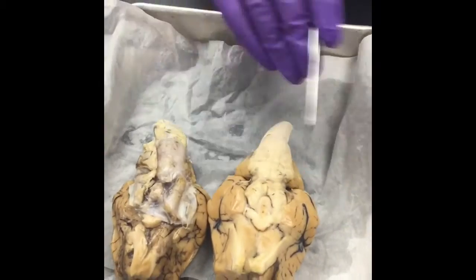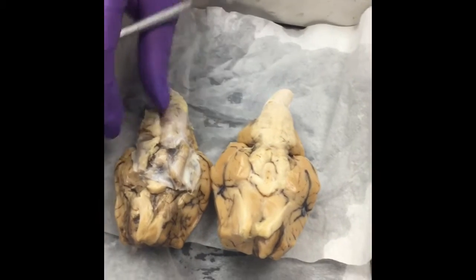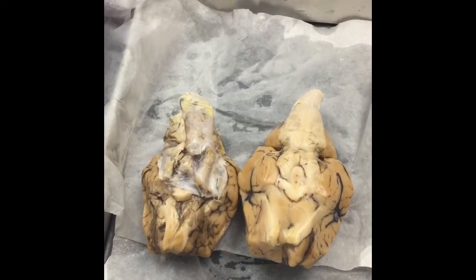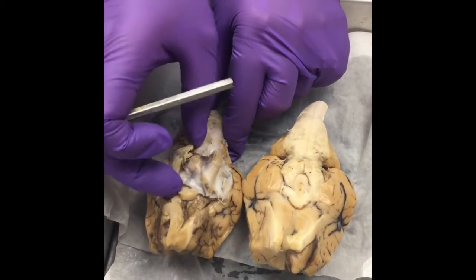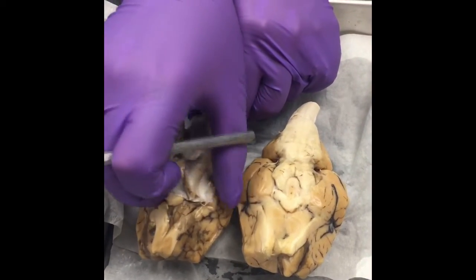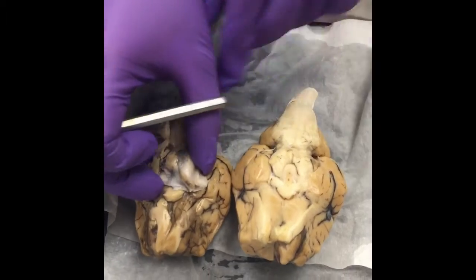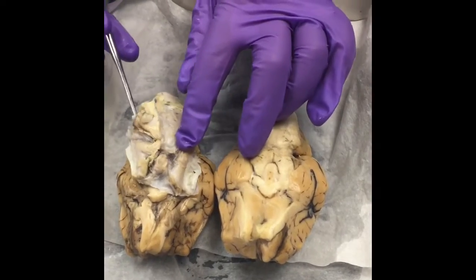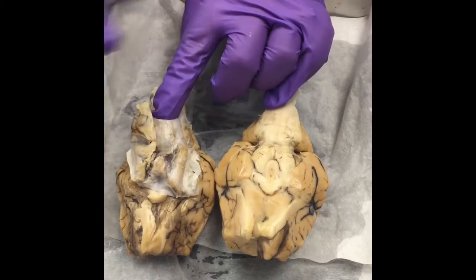You ready? Okay, so they look very different, right? They're both flipped over. So this is the underside of the brain, but this piece has a section of dura mater that's remaining. This one does not. Okay. So I'm going to take off the dura mater so that they look the same.